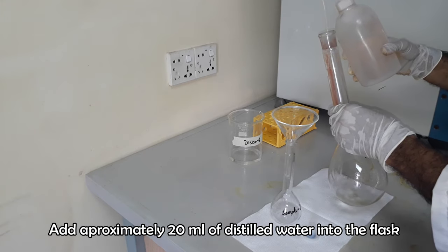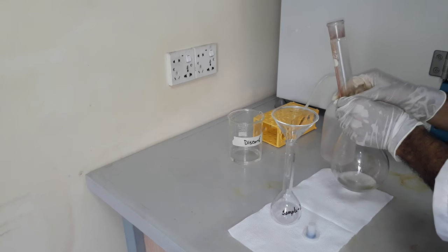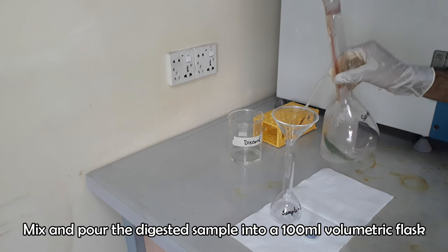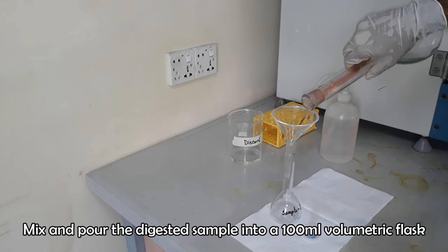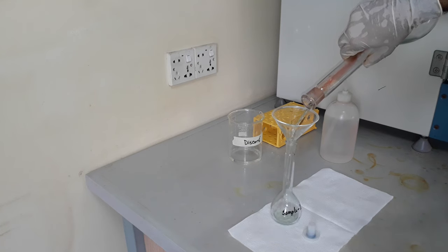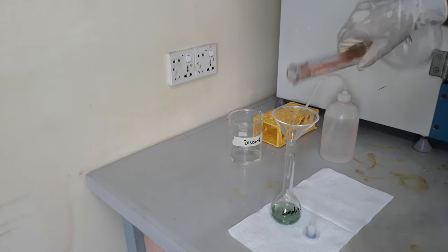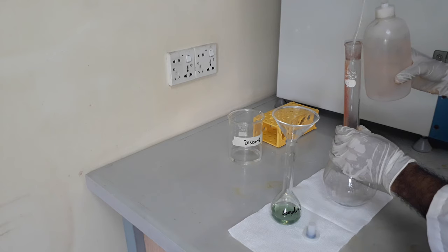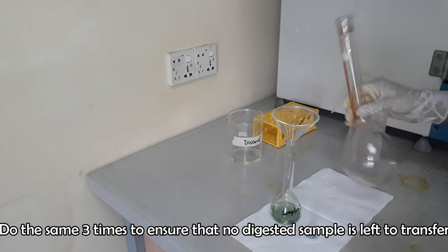Pour 15 to 20 ml of distilled water into the flask and shake to mix with digested juice. Now pour it into a 100 ml volumetric flask. Use funnel to avoid the loss. Do the same thing 3 times by washing the flask to make sure that no digestive residue is left in the digestion flask.